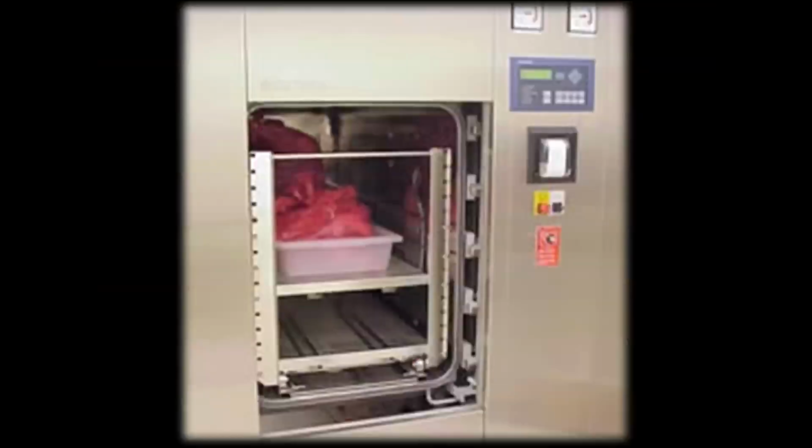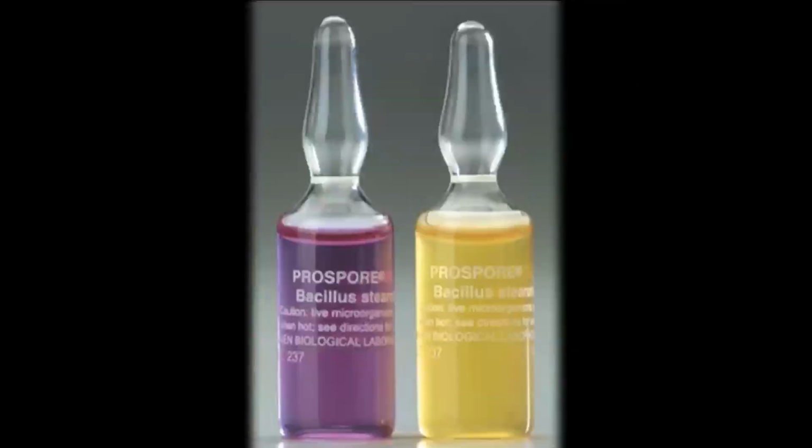So what is done: a culture tube is taken. Within that culture tube, one ampule containing a sterile media and a paper dipped with the spores of Geobacillus stearothermophilus is kept inside the autoclave.